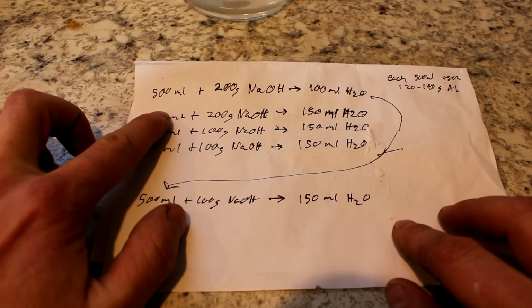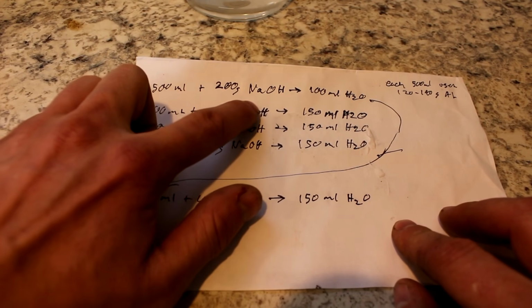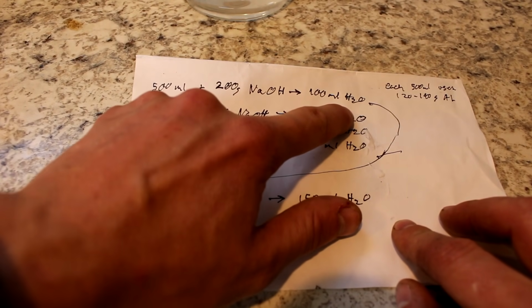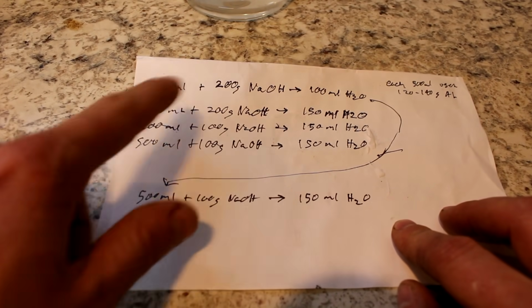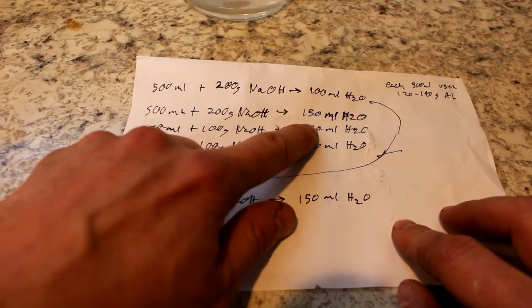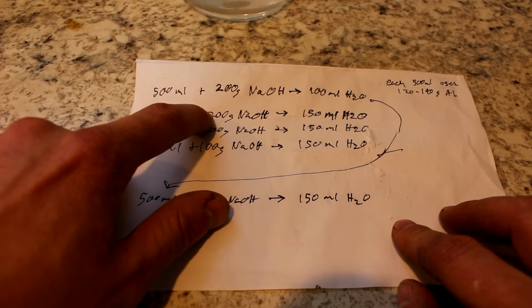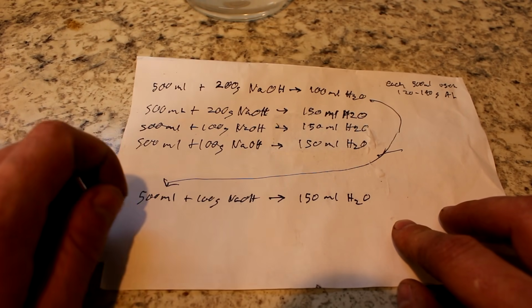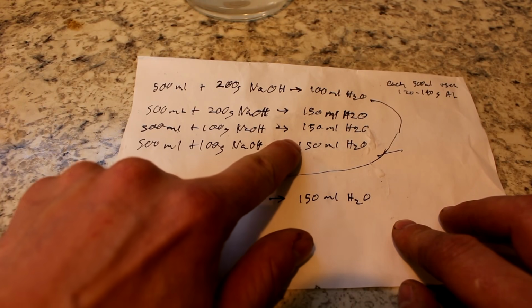See, I had 500 milliliters of water combined with 200 grams of sodium hydroxide. That yielded 100 milliliters of H2O that I distilled out and saved. The next time I got a little bit better, and I got 150 milliliters. And the next 2 times I noticed that the amount of sodium hydroxide was actually quite excess. In fact, the stuff I was washing out of the pot was still highly basic, so I added less hydroxide and I got the same amount of water.